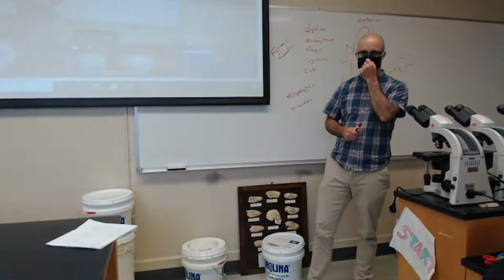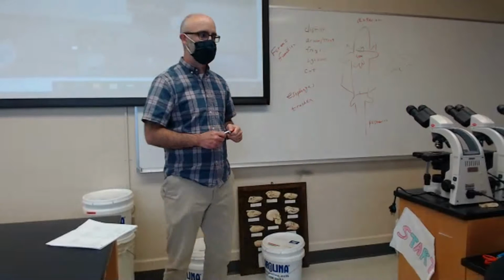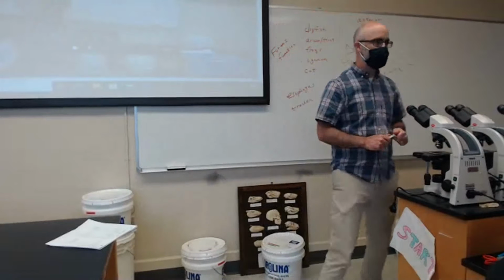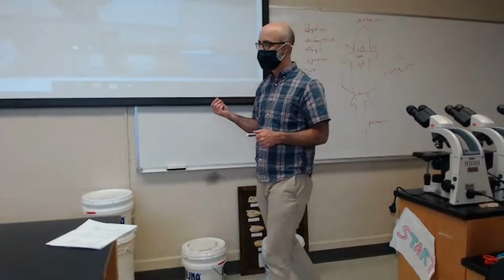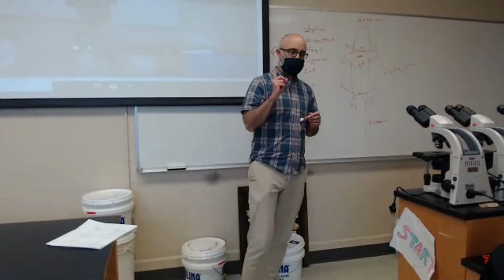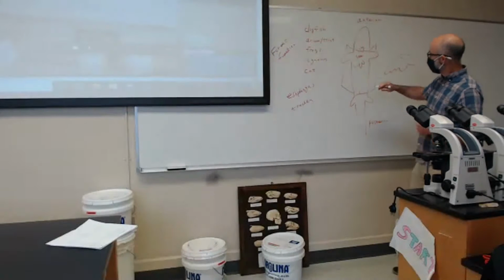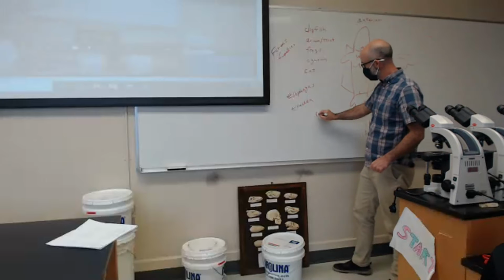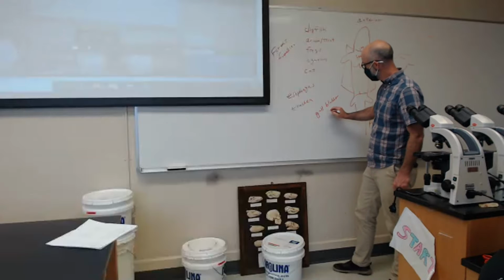And it has a weird consistency. It's almost flaky or granular. Again, we could skip dissections, but you really miss out on that tactile experience, for those of you who are kind of tactile. So the liver's big, it's lobed. And now an organ that you're going to look for in association with the liver is the gallbladder. The gallbladder is always associated or attached to the liver.